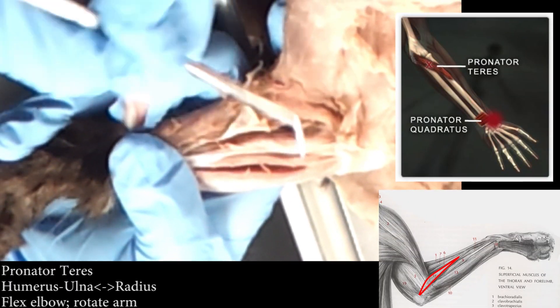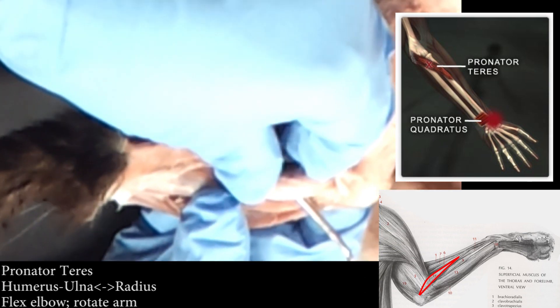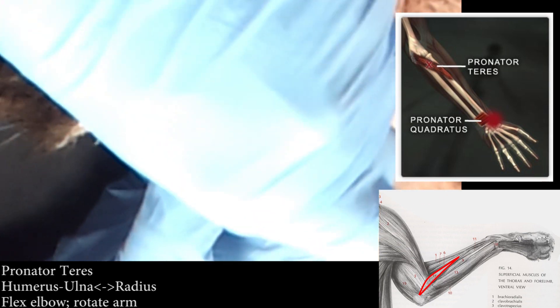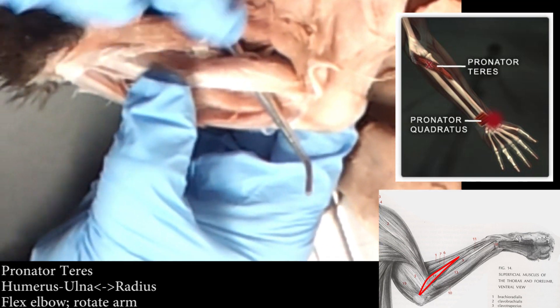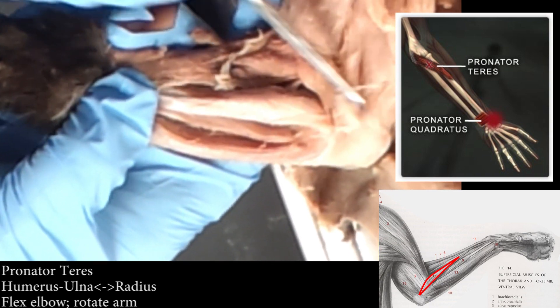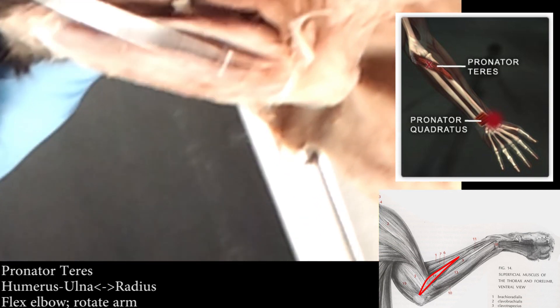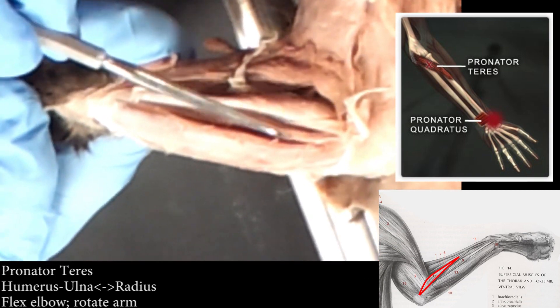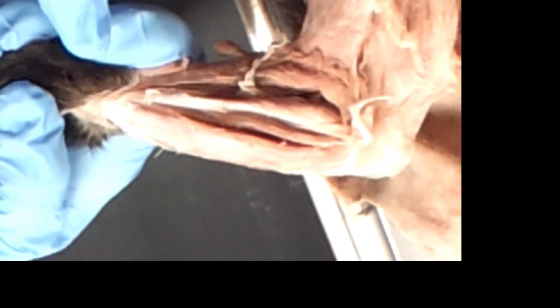And then pronator teres is this little chunky one right here — I've got my probe under it. To me it looks like a boomerang; see how it has kind of a curve in it? I think of the Nike symbol or a boomerang. So pronator teres is the one that looks like a chunk, going into the elbow. Then you've got your radialis, then your palmaris, then your ulnaris. You can remember these as P-R-P-U — think of something gross for PR — and there are some obvious things. So PRPU.